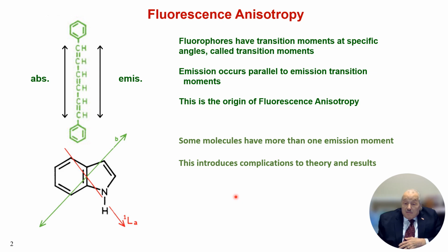Some molecules have more complex structures and more than one emission moment, and this introduces some complexity into the theory and into the results. Even to this day, some ambiguity remains, but we won't worry about that, at least for the moment.